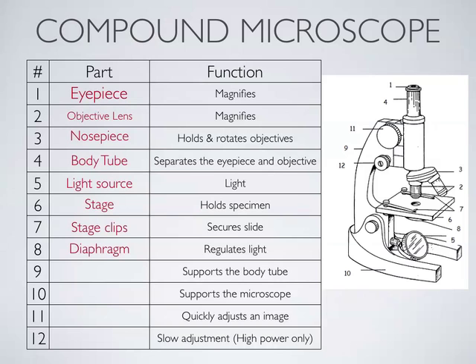You were talking about microscopes, CJ. So on the bottom of the microscope, and the part that you hold on to is called the arm and the base. The base is what the microscope is sort of sitting on. The arm is what you might grab to carry it around. You always want to carry a microscope with two hands. And then we have two more parts. The last two are important. And on this microscope, they look a little different.